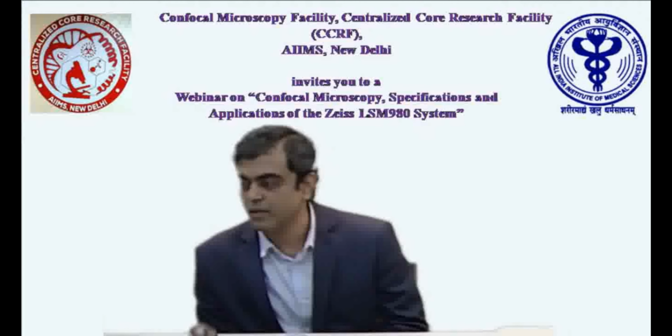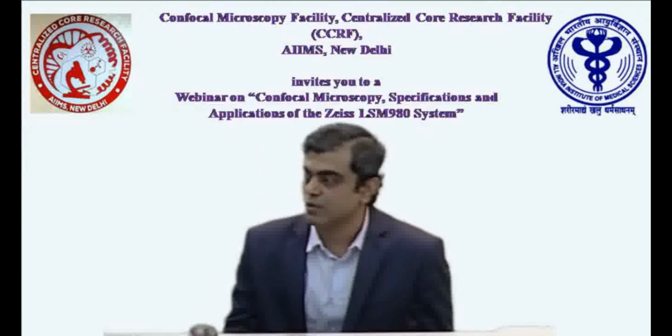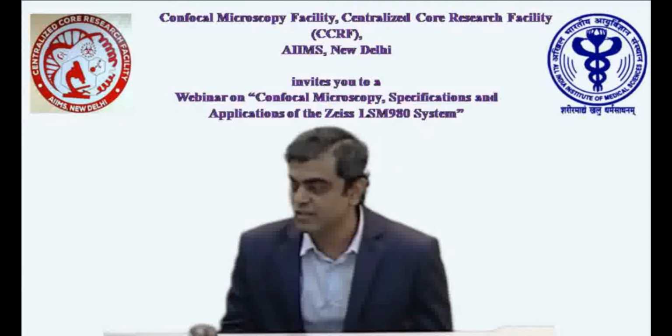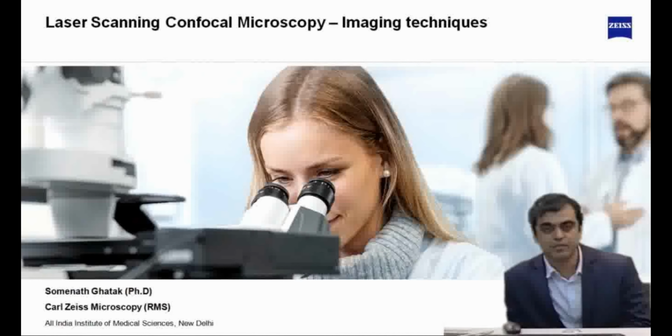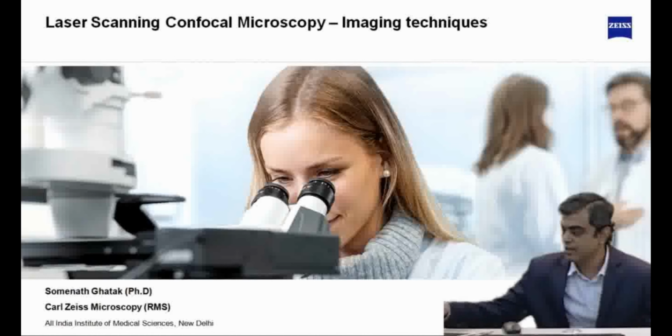This is a platform where we can talk about confocal microscopy to its core, the basic system itself, what samples can be imaged, and what the sample preparation types should be, and everything obviously should be guided by the objective of your studies. So this is a high-end system which will definitely enhance your research work.